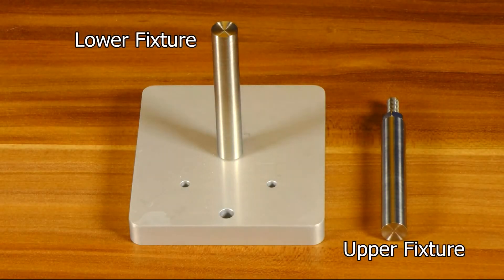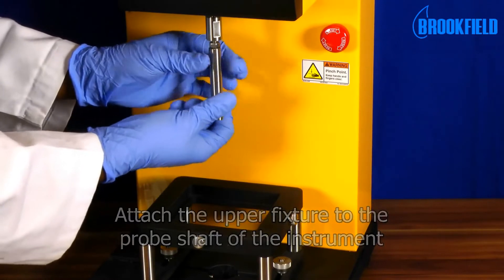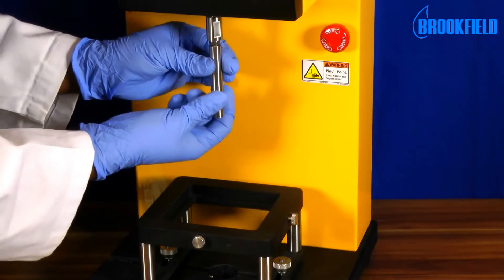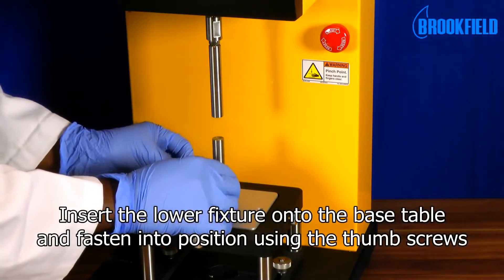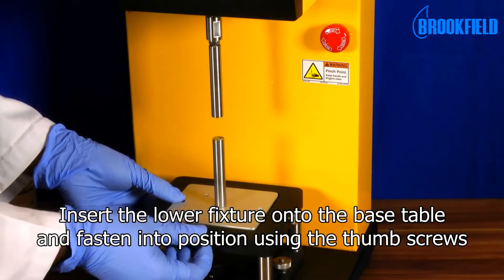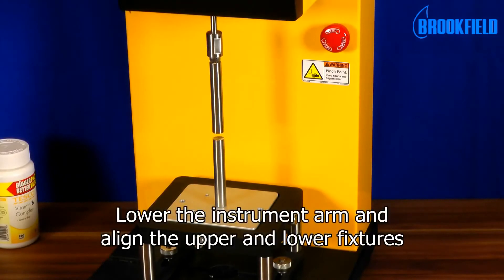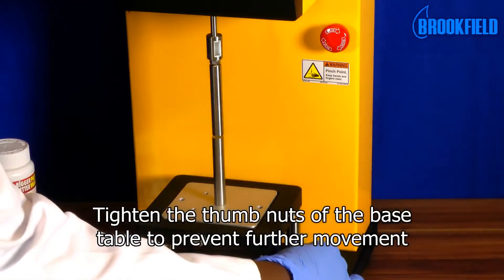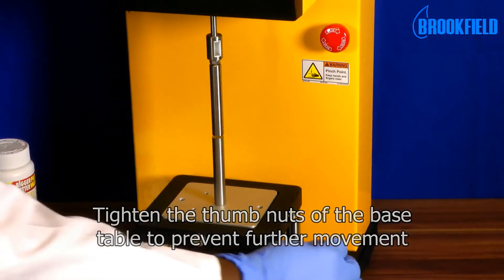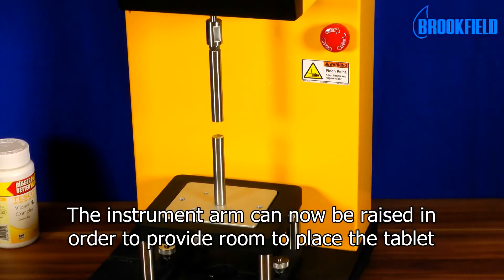Here you see the individual parts of the accessory. To set up the test, attach the upper fixture to the probe shaft of the instrument. Insert the lower fixture onto the base table and fasten into position using the thumb screws. Lower the instrument arm and align the upper and lower fixtures. Tighten the thumb nuts of the base table to prevent further movement. The instrument arm can now be raised in order to provide room to place the tablet.